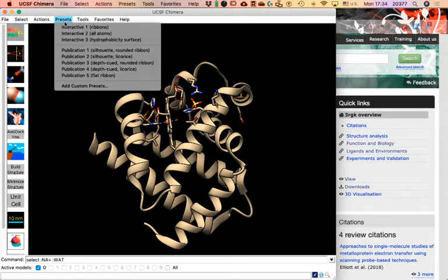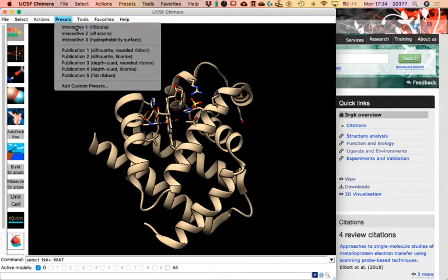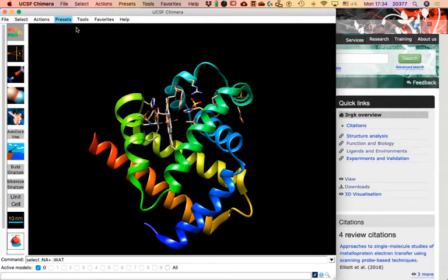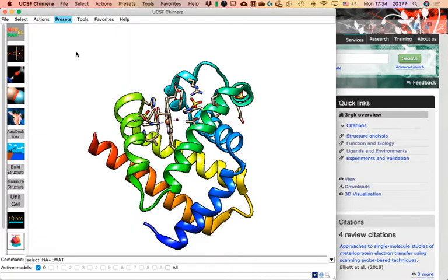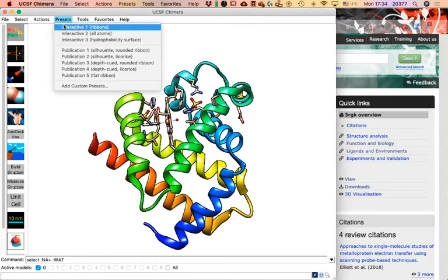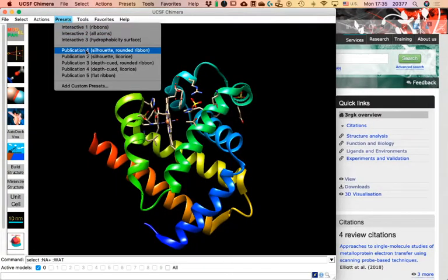The Presets menu is like an automated version of Actions. For example, click on Presets > Interactive 1 (Ribbons) and the screen suffers a couple of changes that we could have done separately but are now automated. Do the same with Presets > Publication 1 and again changes happen at once.